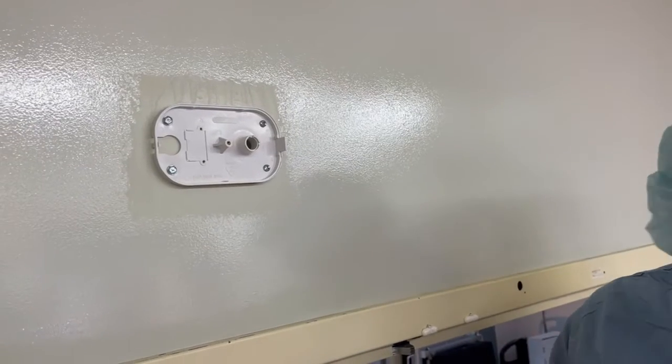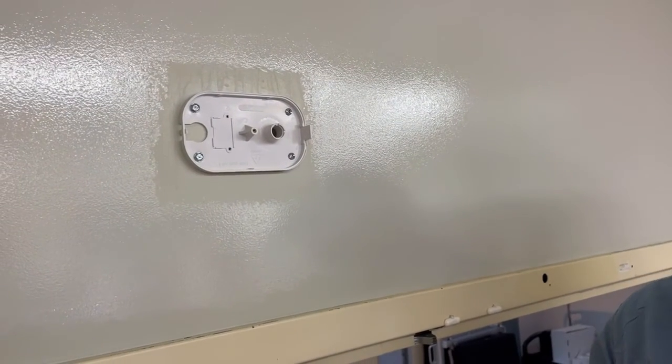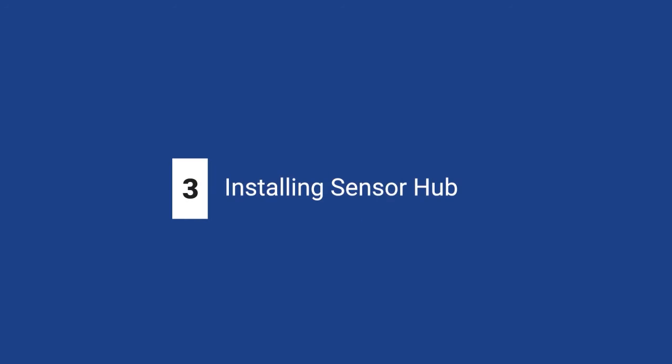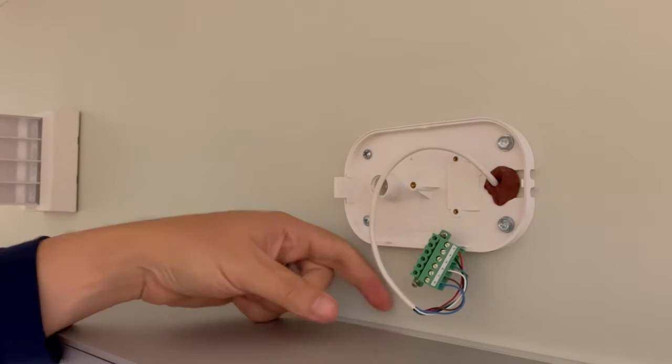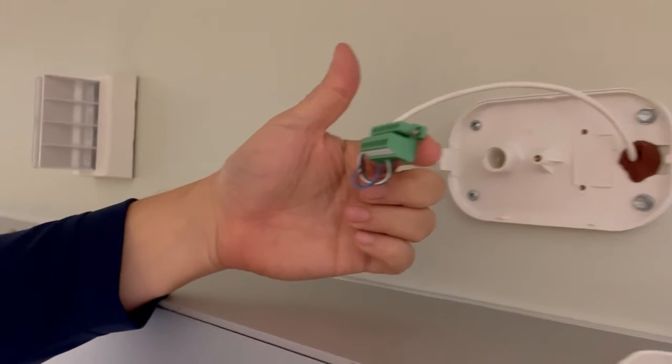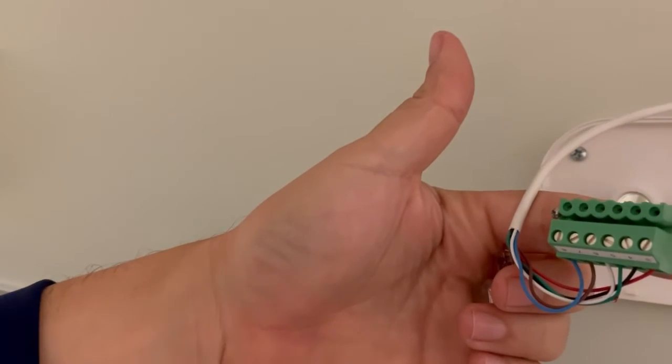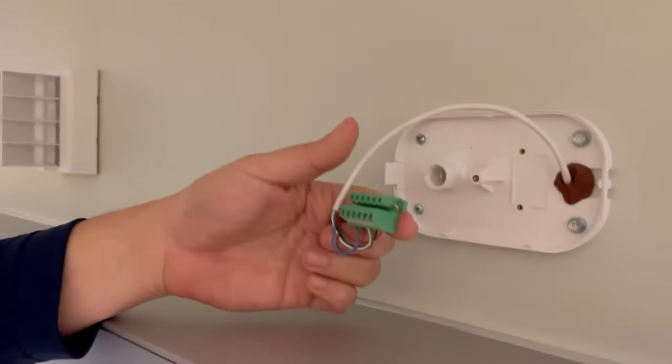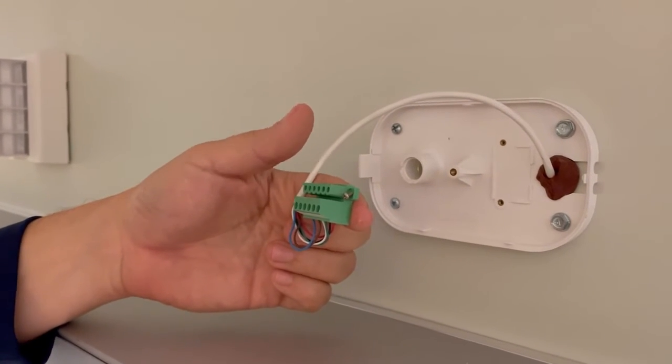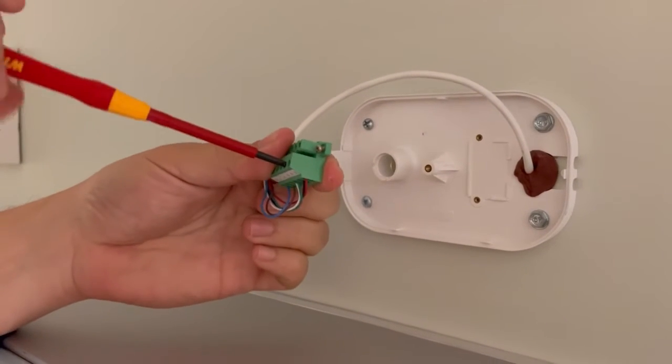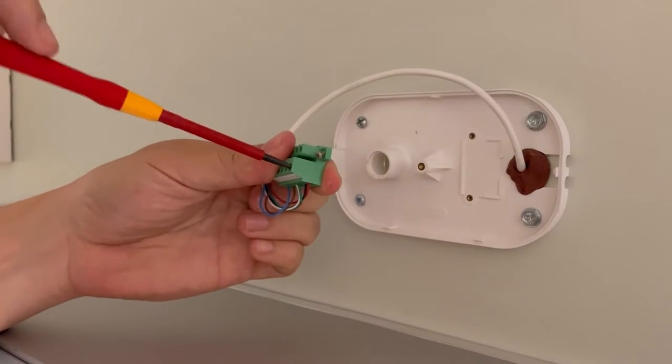On the other side of the door is a very similar panel. Slide to the left because this one is installed the other direction. This side does not have any electronics so there's nothing else you need to do here. You just need this open for passing through the pressure tubing in the next step.